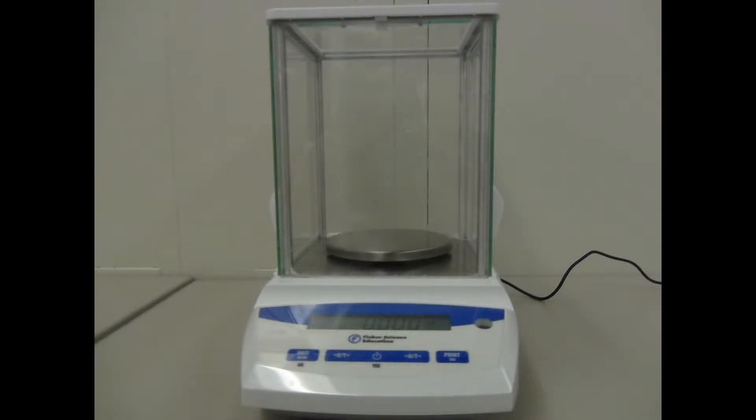Make sure you calibrate the balance before using it. For step two, you are going to clean all of your glassware and your workstation.